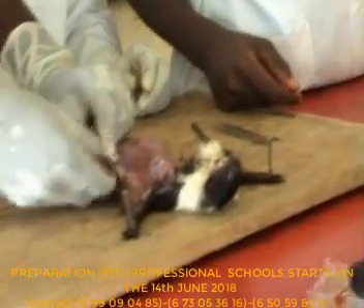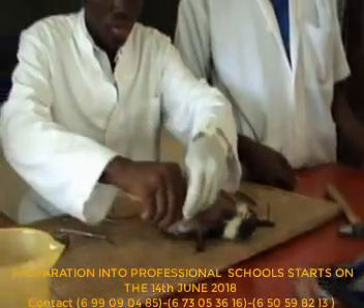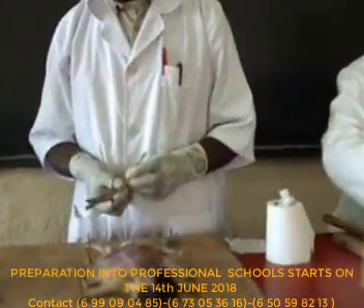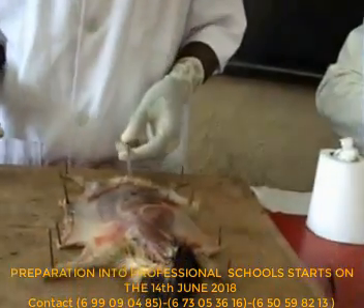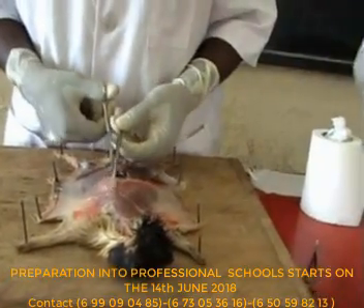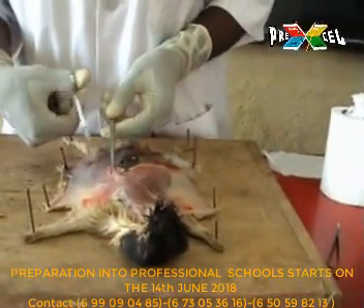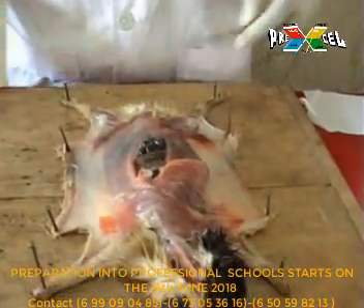This is what you do — pin it onto the board. After pinning it, make another incision again on the abdomen. Hold the tissue and cut to expose the internal contents. Then use the probe again to cut upward, but this time cut only up to the level of the xiphoid cartilage. When you reach the xiphoid cartilage, stop. Turn it again and cut down.